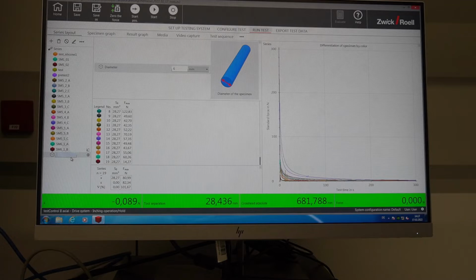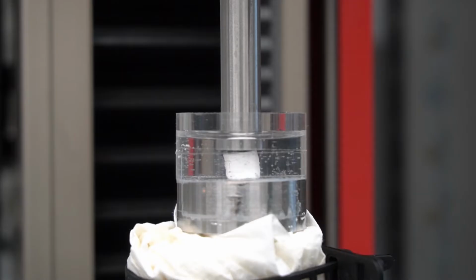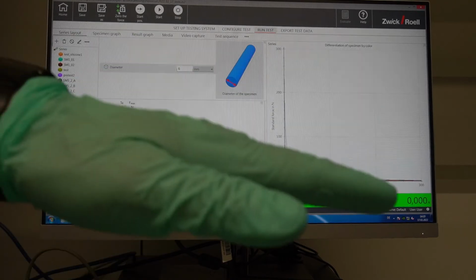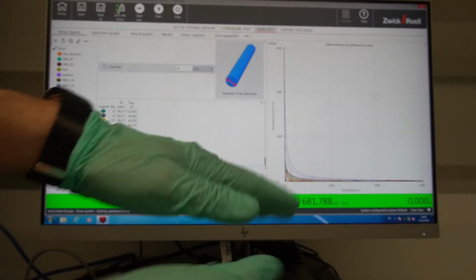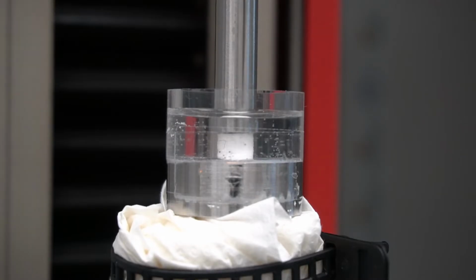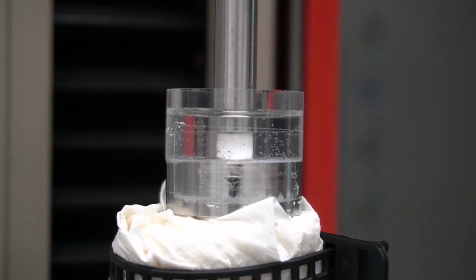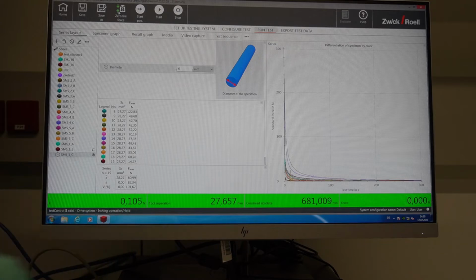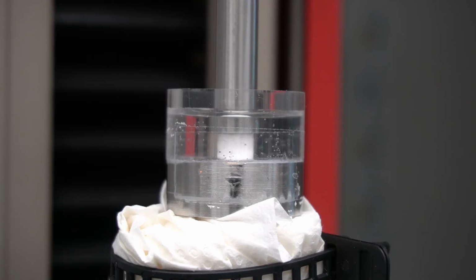This is our specimen SM6_1_C. The next step is to apply preload. This is the force signal. I'm zeroing it, and to ensure good contact between the top and bottom surfaces, I'm applying around 0.1 Newton of preload. Here. Okay, that's good. Okay, ready. Let's start the test.